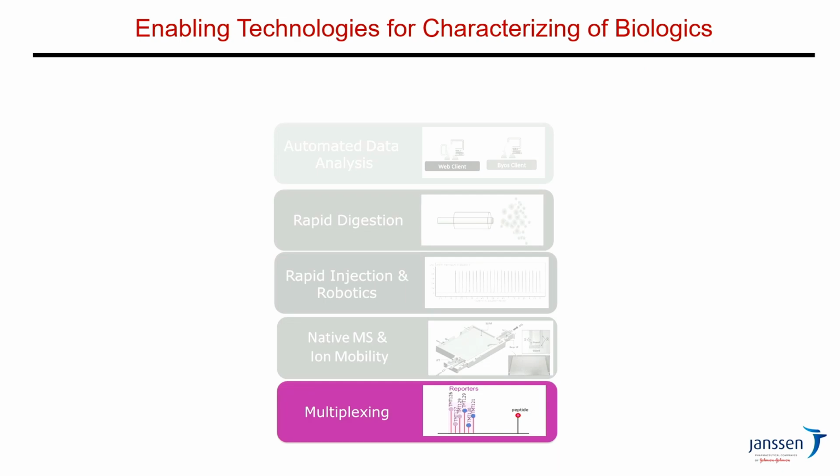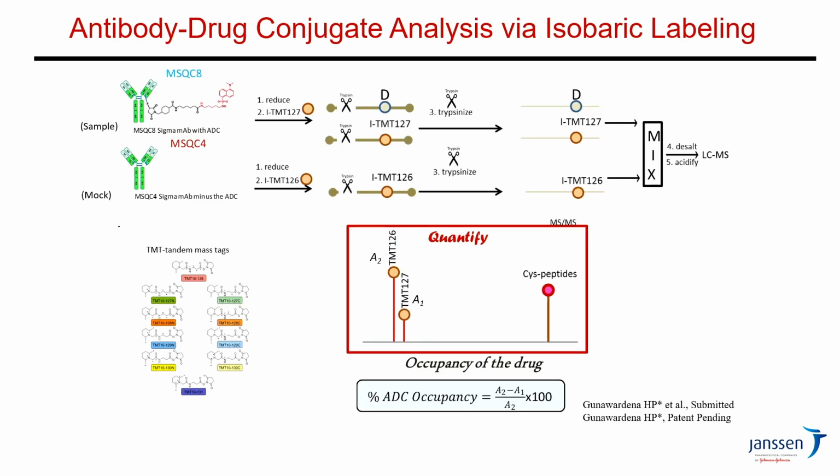Multiplexing. This is my final topic, to describe multiplexing, and I'm very excited to share this with you, where this has not been typically done in pharma settings. It's typically done in the proteomics community, but we've developed a workflow not just to use multiplexing to quantify, but also to do two other things, namely normalization as well as identification of the conjugated peptides.